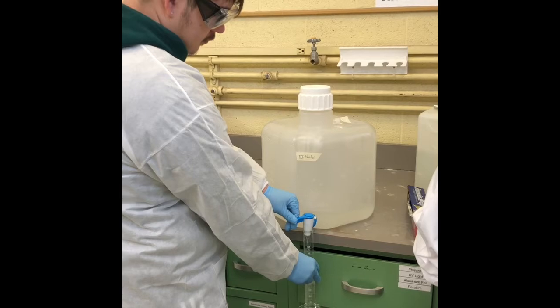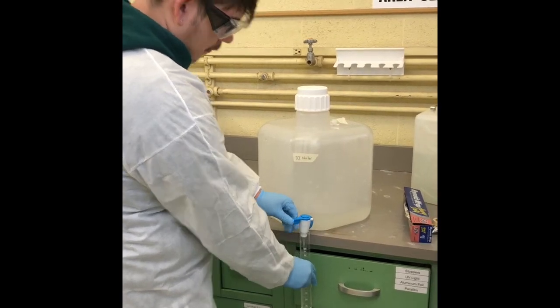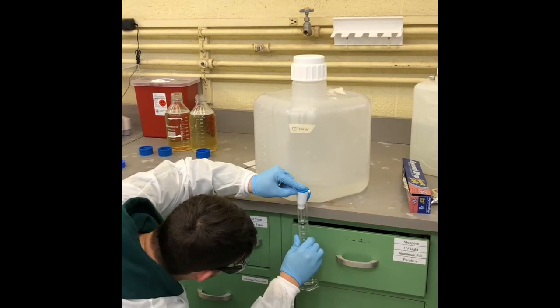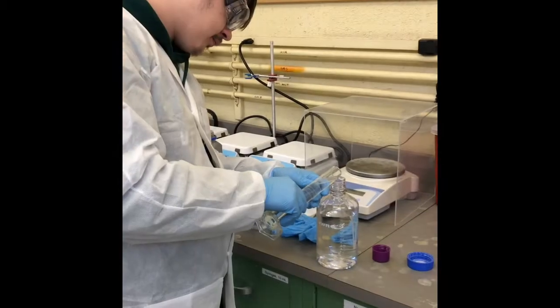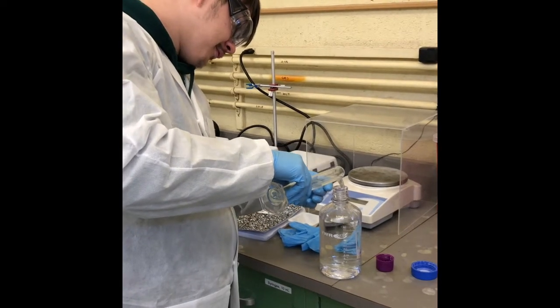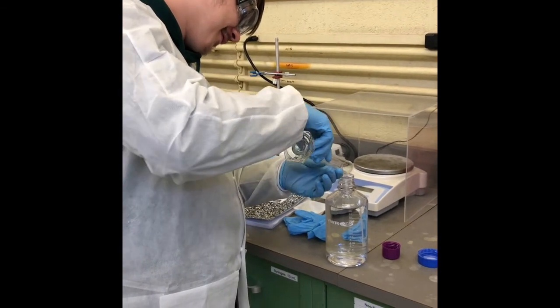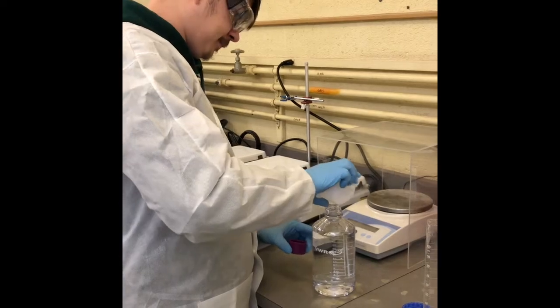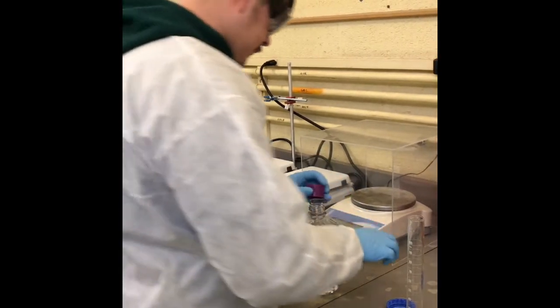When making the media, we measured out 1 liter of deionized water 3 times. 20 grams of M9 salts was then measured 3 times. Each of the 1 liter bottles of deionized water then received the 20 grams of M9 salts.